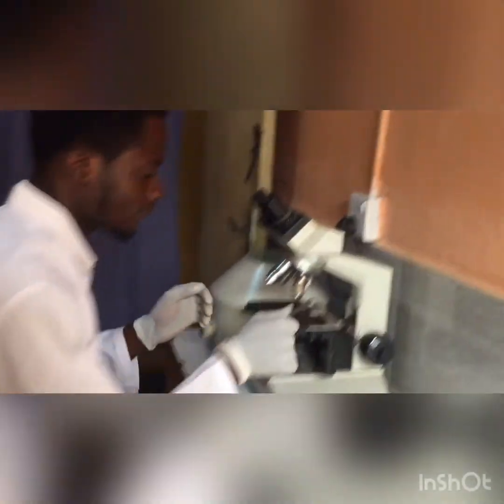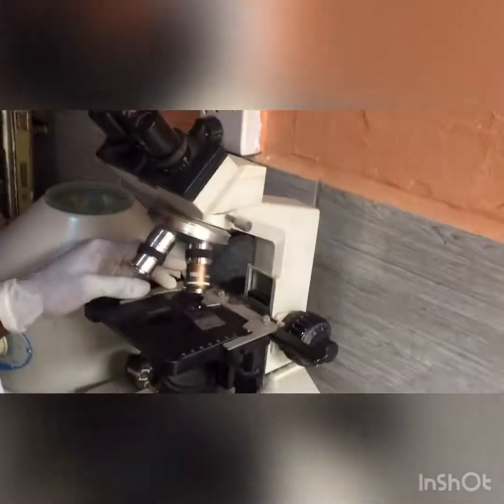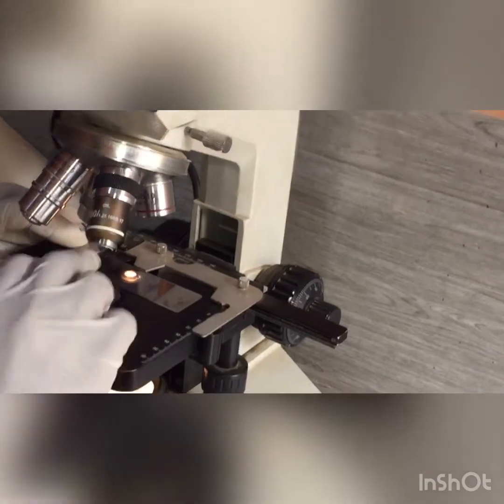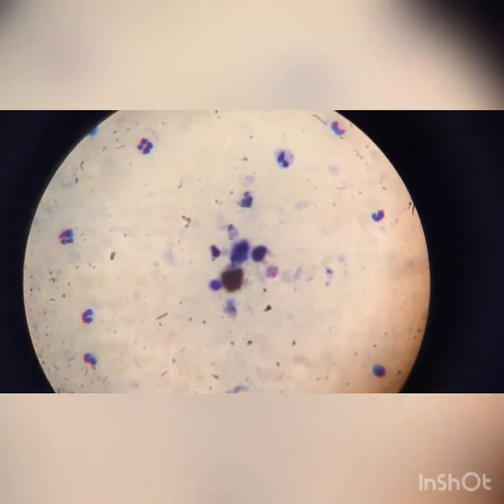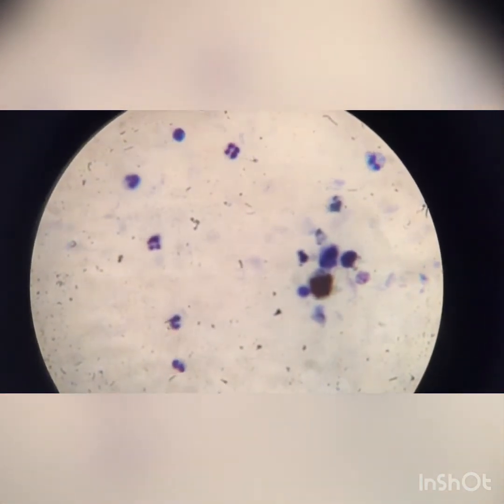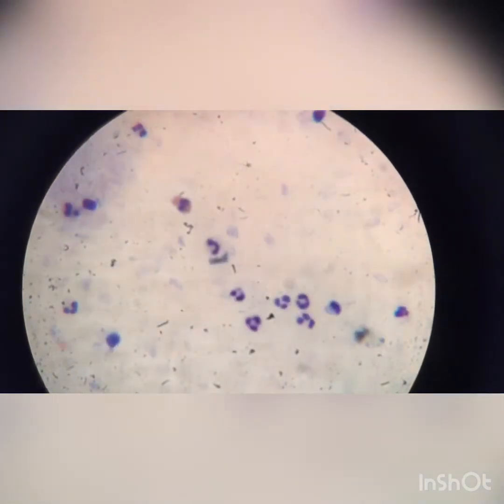Come along with me. I'm going to put it on my mechanical stage on my microscope. I'm going to be using the 100x objective. After focusing the microscope so closely, you can see the malaria parasites in the blood. All those things you see there — those are the malaria parasites. Look at that!